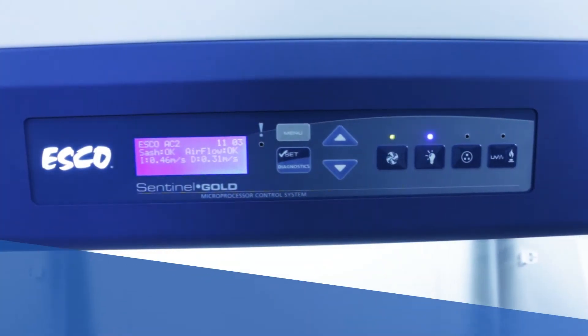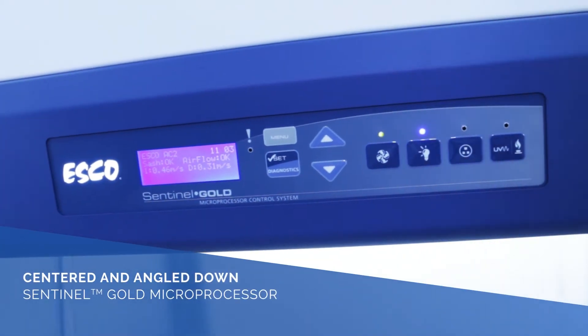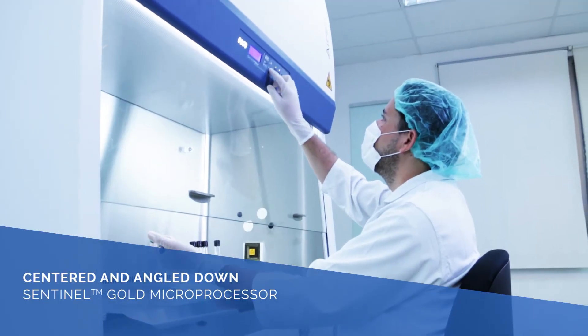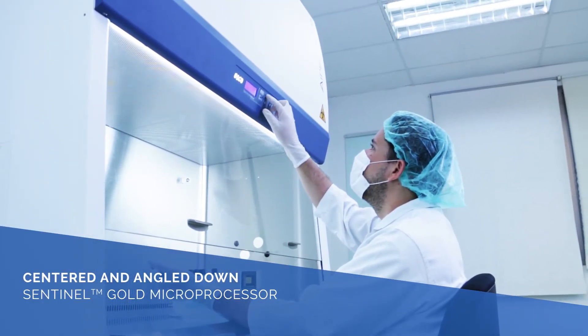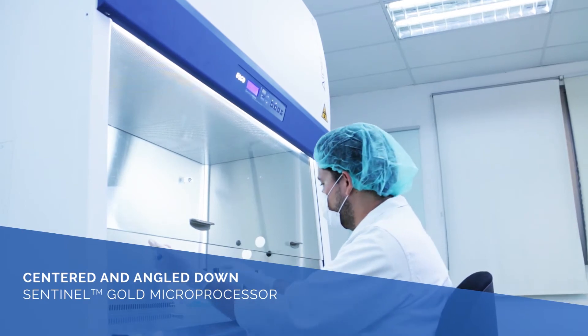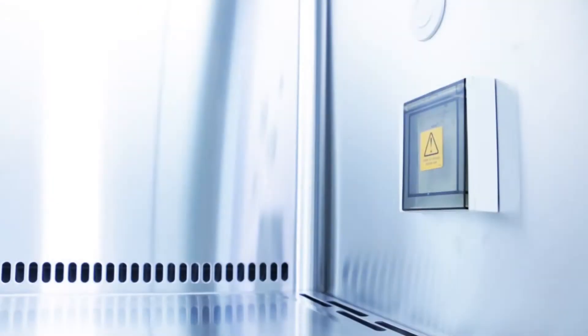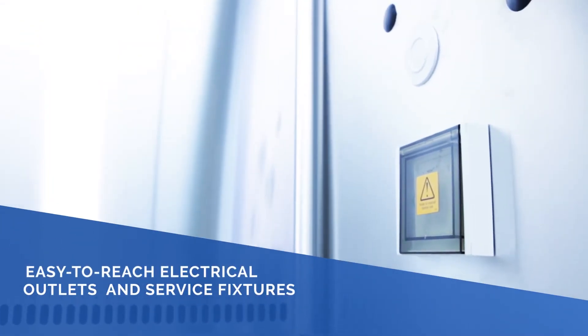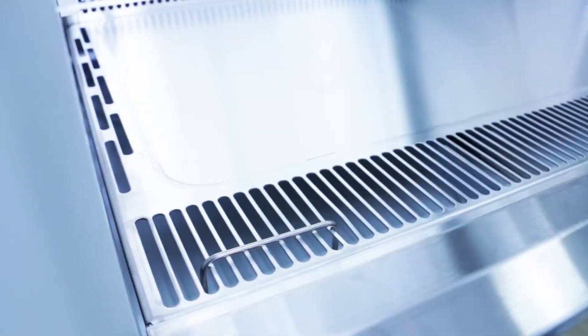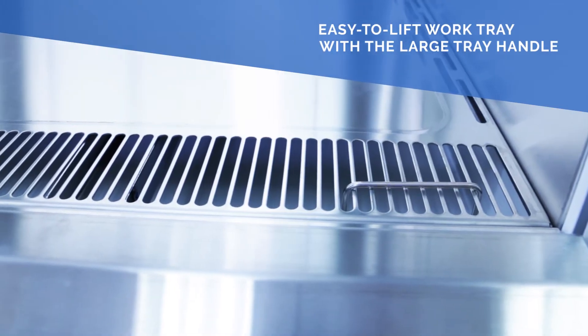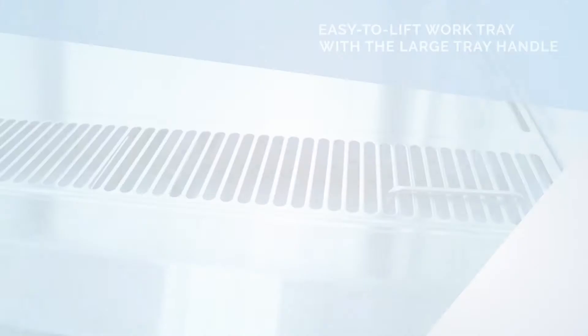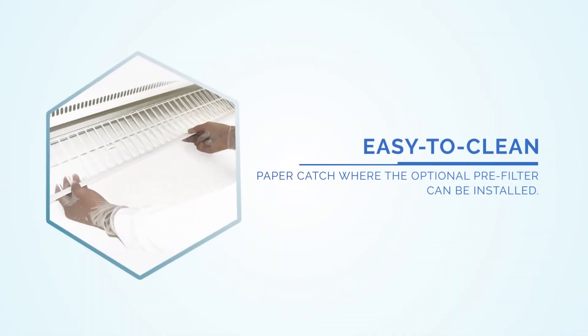Maximize productivity with the ergonomic features that include centrally located Sentinel Gold Microprocessor Controller for easy reach and angled down design for easy viewing, work zone with easy to reach electrical outlets and service fixtures, hassle-free lifting of your work tray using the large tray handle, and removable paper catch where the optional pre-filter can be installed.